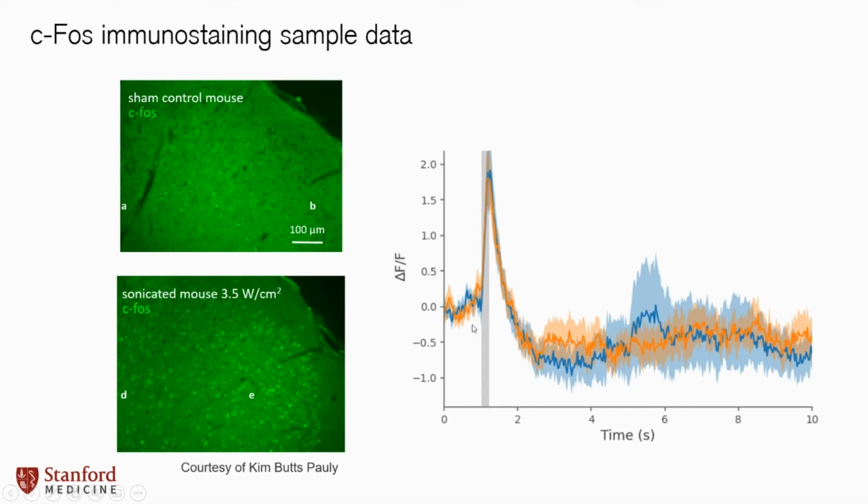And what's happening is, I'm sure to everybody looking, really exciting stuff. You're getting this fast response and this inhibition. So you can't see that with c-Fos. I recommend people move away from that.